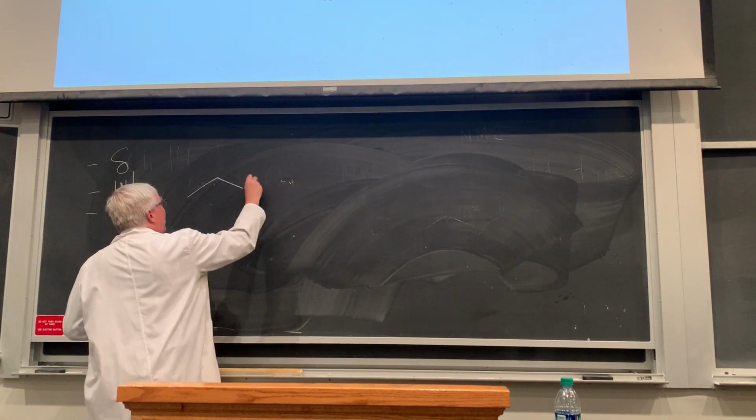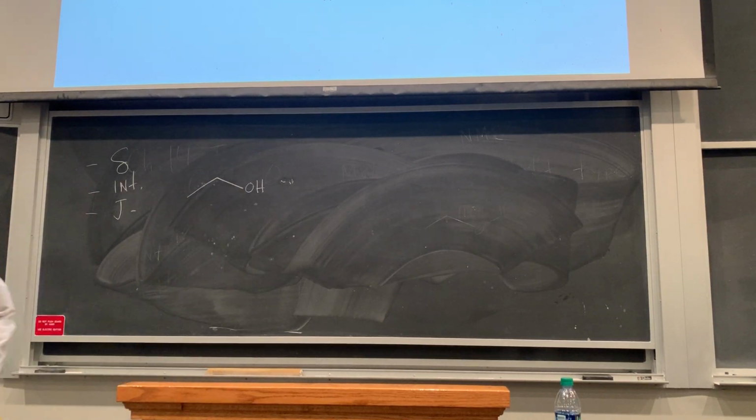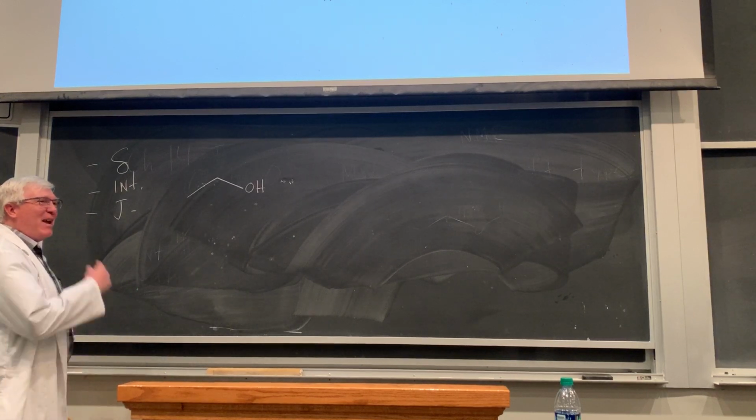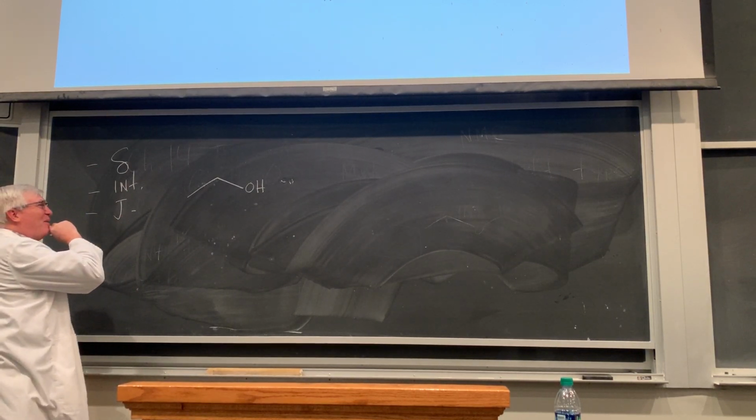So we already looked at this molecule. Remember last time? The actual sample with hydrogens in it that the physicists went over to the chemistry department supply shop and they gave them a sample of ethanol. And when they tuned up their spectrometer, they were amazed to see these splitting patterns. So splitting came along quite early.